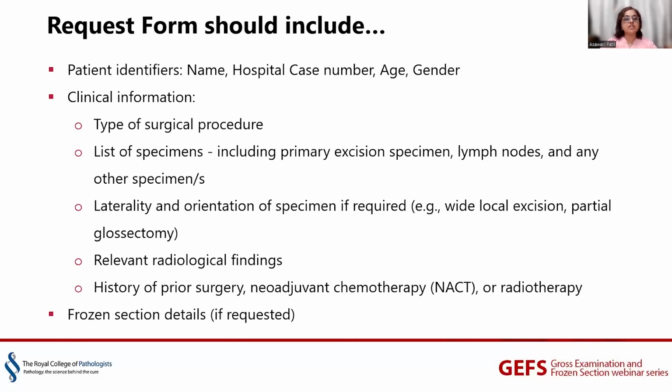Now, if there is any frozen section done, those details should be available at the time of grossing, because those who are doing frozen section, all of you know that any tissue which is submitted for frozen section, the rest of the tissue is again processed for paraffin embedded tissue.